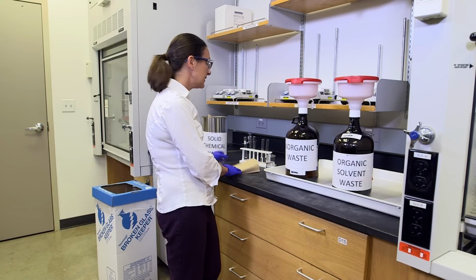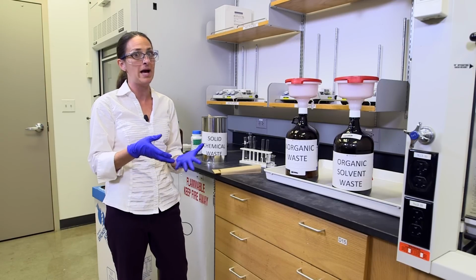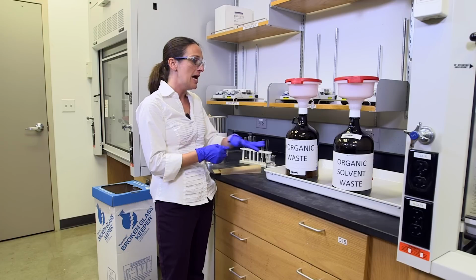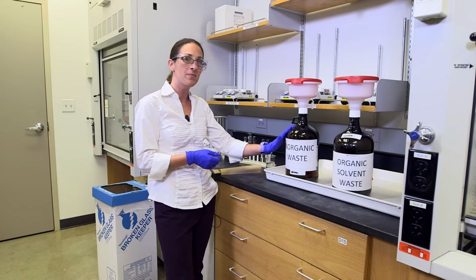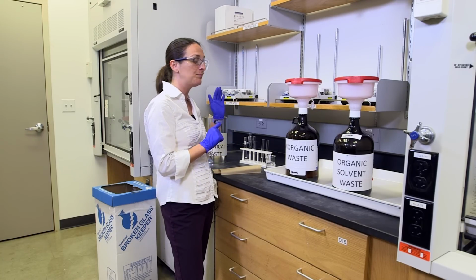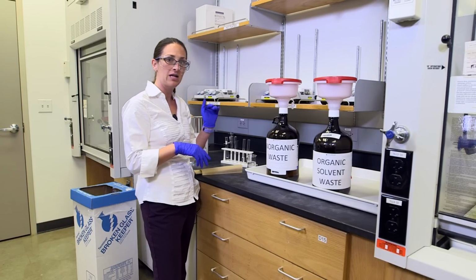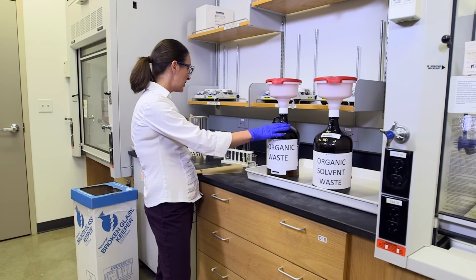For liquids, what we're going to distinguish between is pure water. If you used pure water for a water bath, that could go down the sink. What cannot go down the sink is water, even with just trace amounts of anything else, any other solvent. And we separate it into inorganic, meaning metals, and organic. So remember on the periodic table, anything to the left of that metalloid stair-step line is a metal. So all of our salts, sodium hydroxide and sodium sulfate, all of those ionic compounds that have metals are going to go in our inorganic waste.